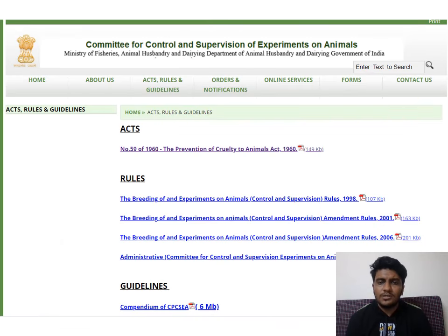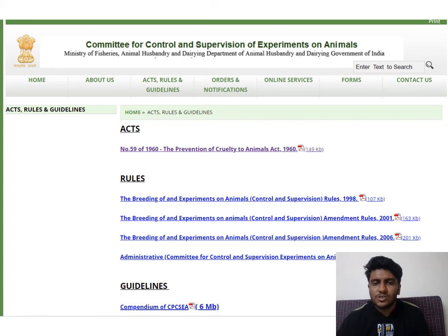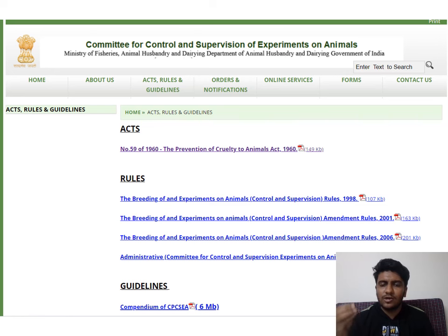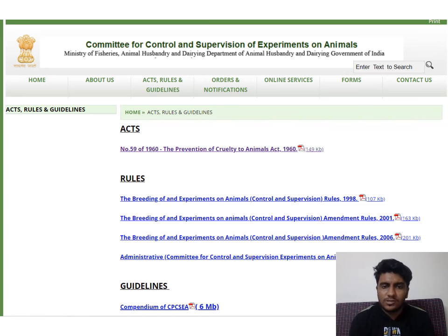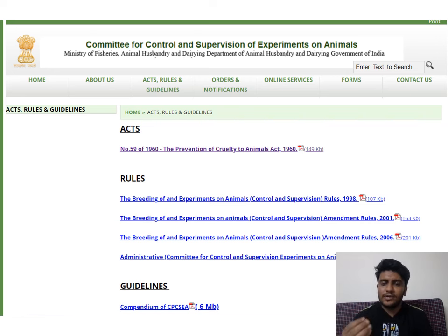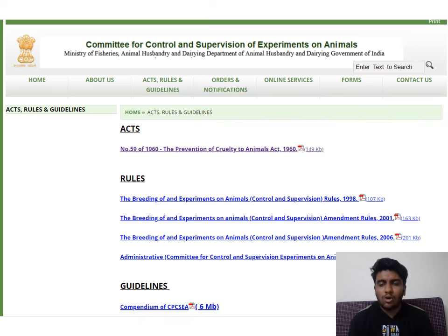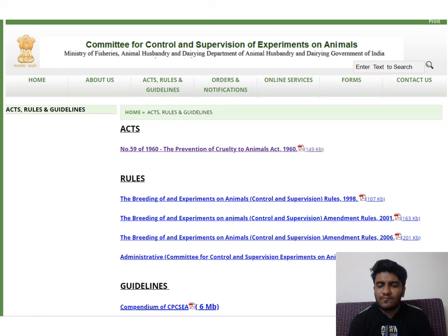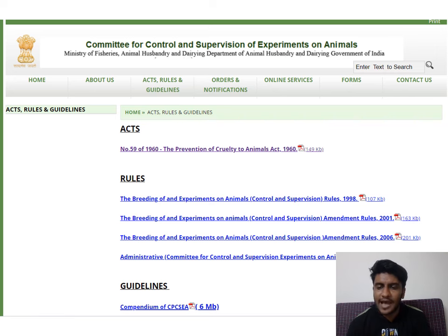The Committee for the Control and Supervision of Experimentation on Animals, CCSEA, sets certain rules, acts, and guidelines that we have to follow while handling and performing experiments with animals. They appoint the IAEC — Institutional Animal Ethics Committee. According to that committee, if you get approval for animal studies, you have to follow certain protocols, guidelines, and regulations while dealing with animals.